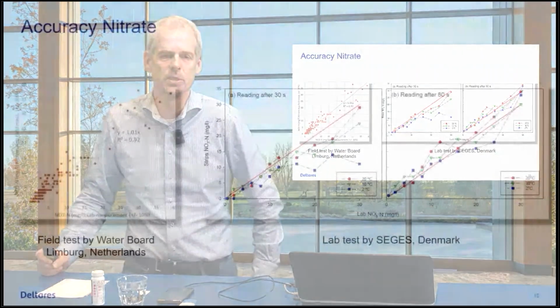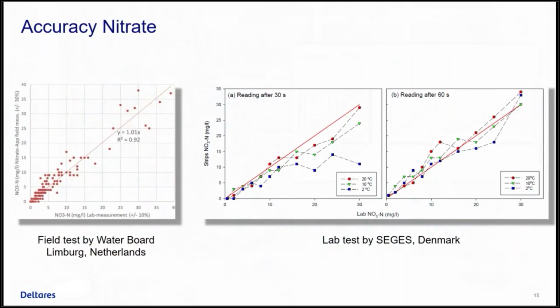Okay, and then I wanted to share with you some information about how accurate the measurements are, especially for nitrate. We use the test strips, and those are not officially certified lab measurements. So the precision is not as good as the measurements in the laboratory would be. But when you're a bit experienced, you can really get it within like 10-20% inaccuracy, so 80 to 90% accuracy.